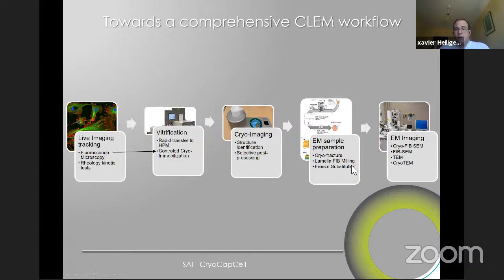And then we have the EM sample preparation. So the cryofracture, cryo-FIB lamella, freeze substitution, whichever technique you want to use. And this is very wide open. There are as many EM sample techniques as you have fluorescence imaging techniques. It's very broad nowadays. It's no longer just single technologies. And then the EM technology per se, where you can do FIB-SEM, cryo-FIB-SEM, TEM, scanning block face imaging, you name it. There are so many ways. So the idea is, where do you want to do your next step of imaging?